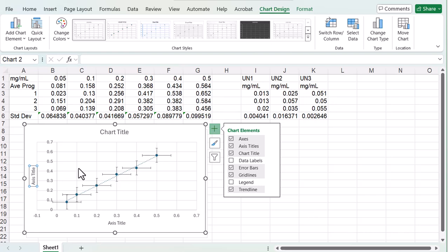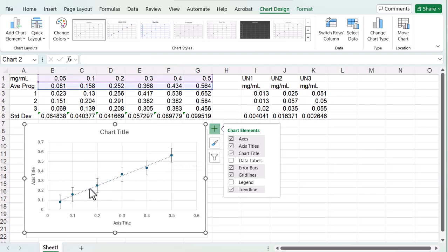So that generates this chart, and now all of a sudden you see places. I will be able to just click on these and type in what I want for the chart titles and stuff. And then you see your data points, and you see this trend line. And then we'll first work on the error bars. You see that by default, there are default values. They're all the same. I don't want horizontal error bars in this case, so I click on it, go to your keyboard, hit delete, and then those horizontal error bars are removed, and then you have just the vertical error bars.